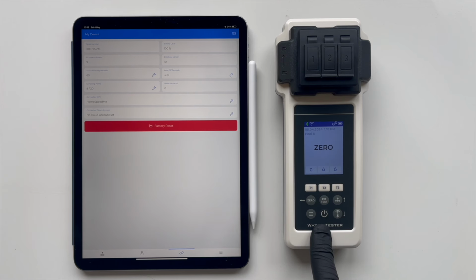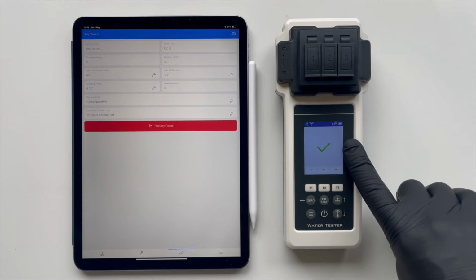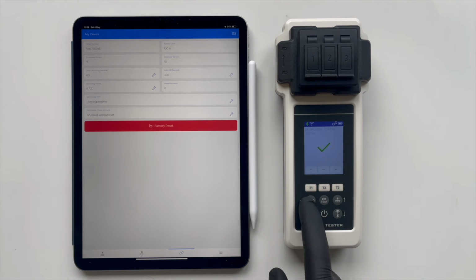Now that the login and password have been successfully saved on the tester, and we've confirmed the Wi-Fi connection, we can proceed with the next steps. Press the Bluetooth button once again and check for a connection. On the screen, we see a check mark flashing blue and green. This indicates that the connection has been successfully established. Press 0 to return. Now, we need to save the cloud storage access details in the tester.